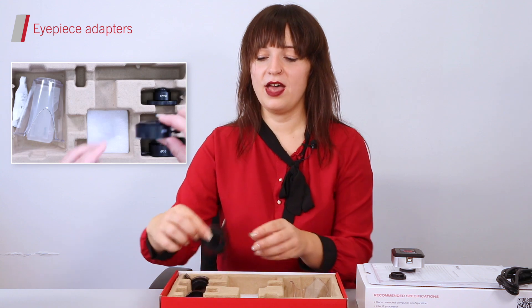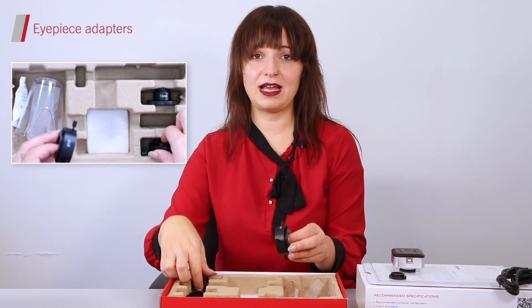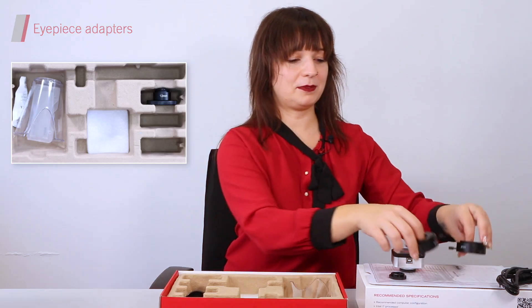If you're planning on using your Moticam A with a monocular or binocular microscope, what you will find at the bottom corner of your box will be extremely useful to you. You can choose between a 30mm eyepiece adapter or a 38mm eyepiece adapter.